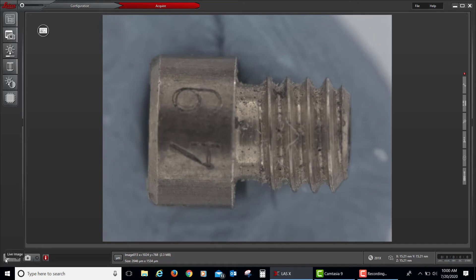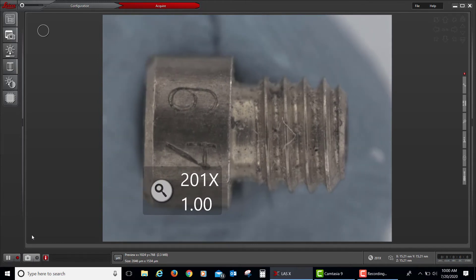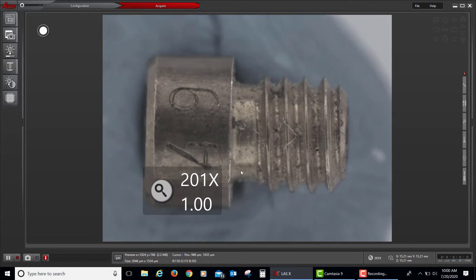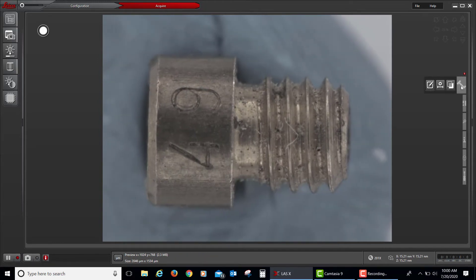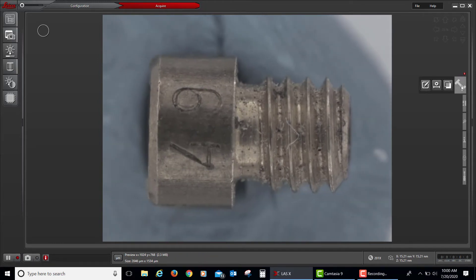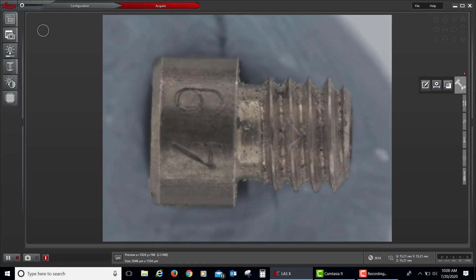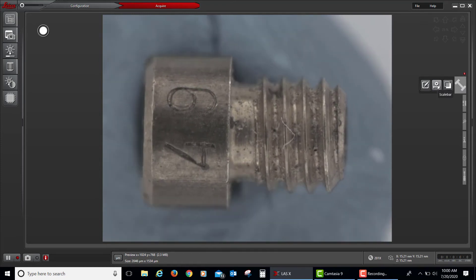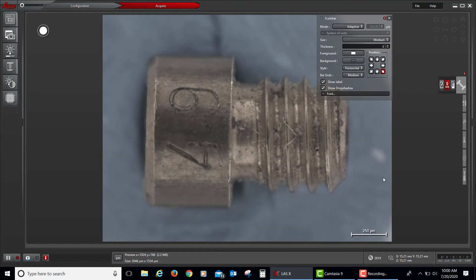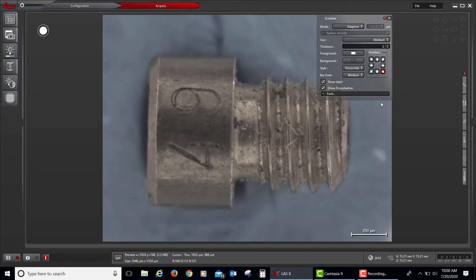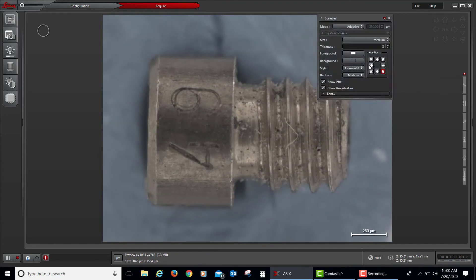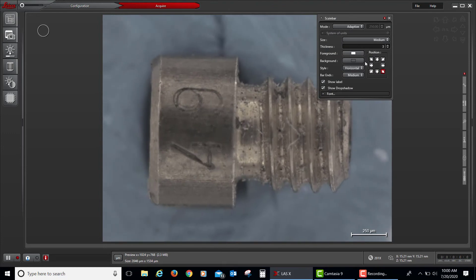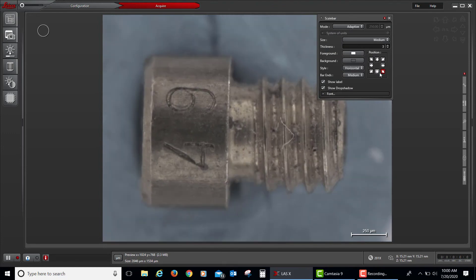If I go back to the live mode, which is using the play button in the lower left-hand corner, and decide I want to take a picture with the scale bar on it, then I move over to the right-hand side of my screen and turn on the scale bar button. It now shows in the lower right-hand corner, but there are nine different places on the screen where it can be shown.